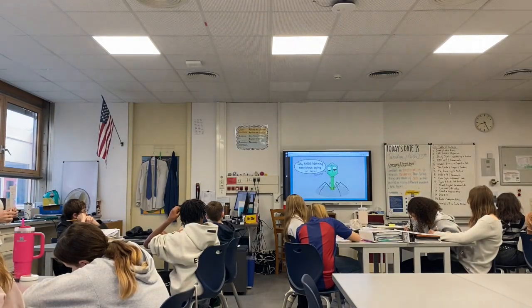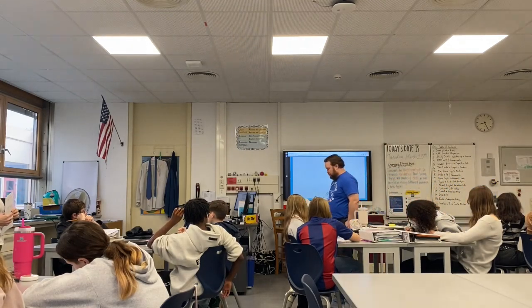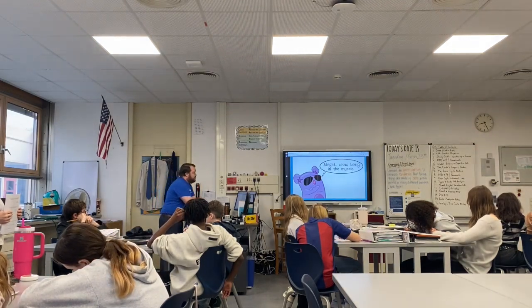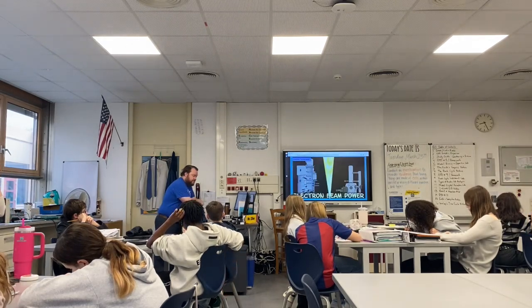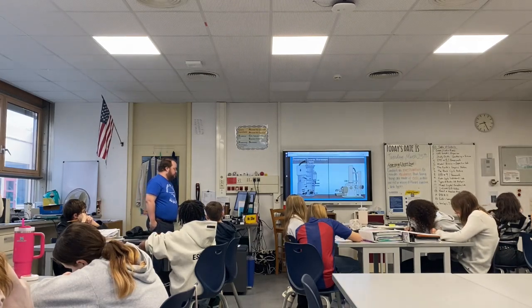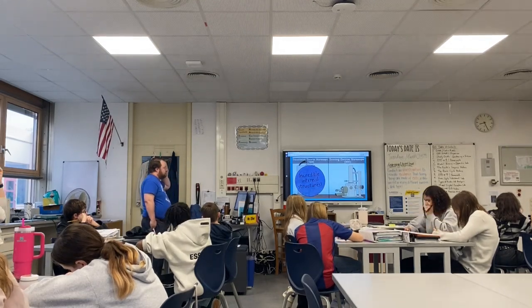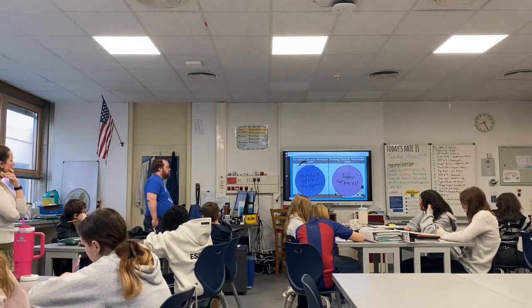For example, what if we wanted to see a virus? Viruses are generally very small, typically much smaller than the average bacterium. How can we increase magnification and resolution abilities? That's where electron microscopes come in. Electron microscopes use electron beams to visualize images. Transmission electron microscopes, TEMs, tend to be the most ideal for visualizing structures within a specimen, while scanning electron microscopes, SEMs, tend to be most ideal for visualizing the 3D surface.